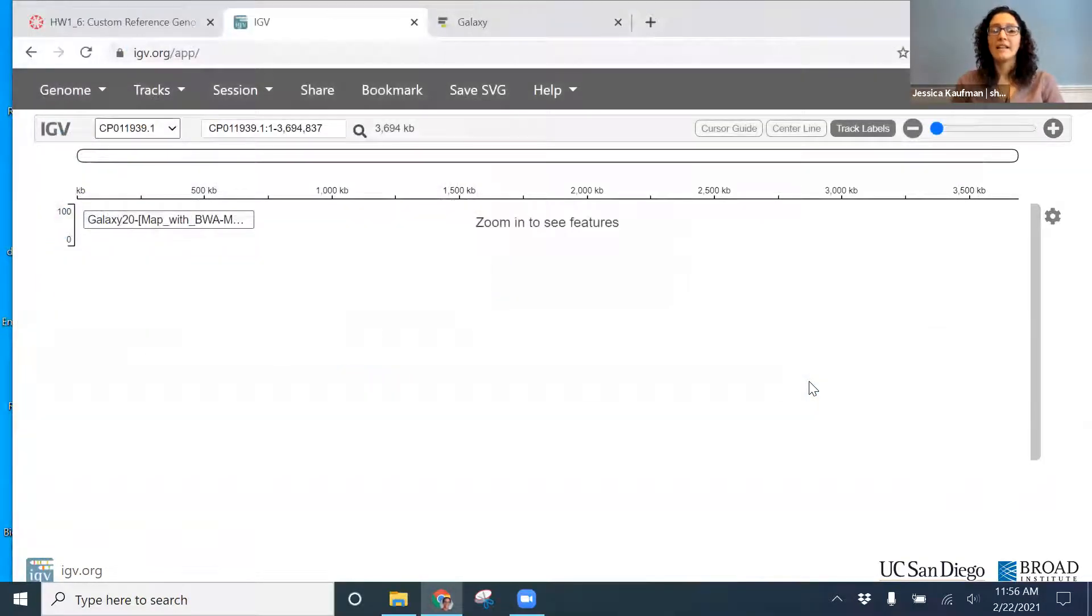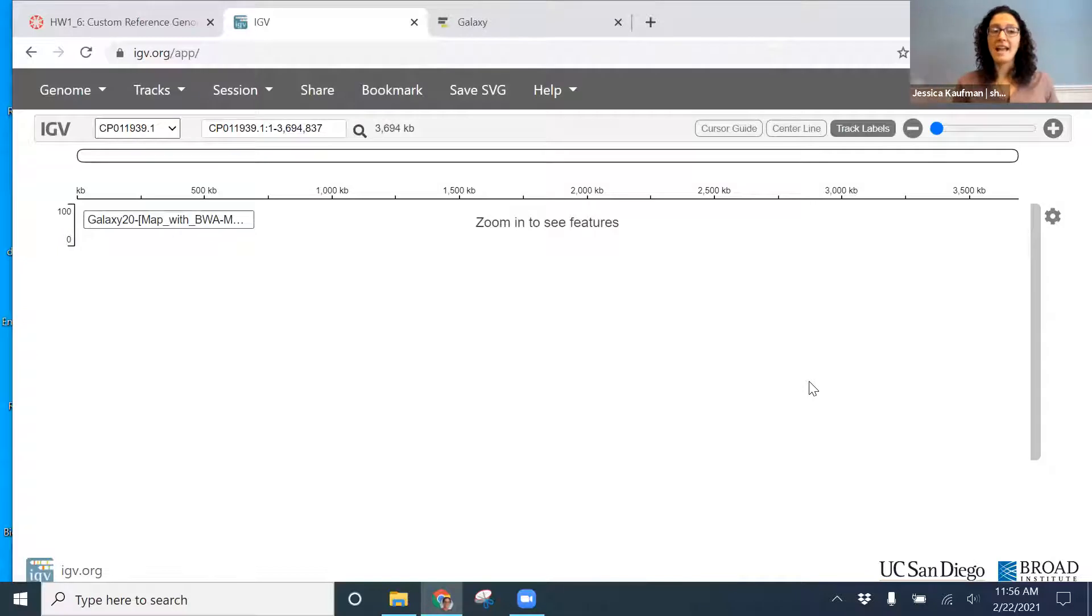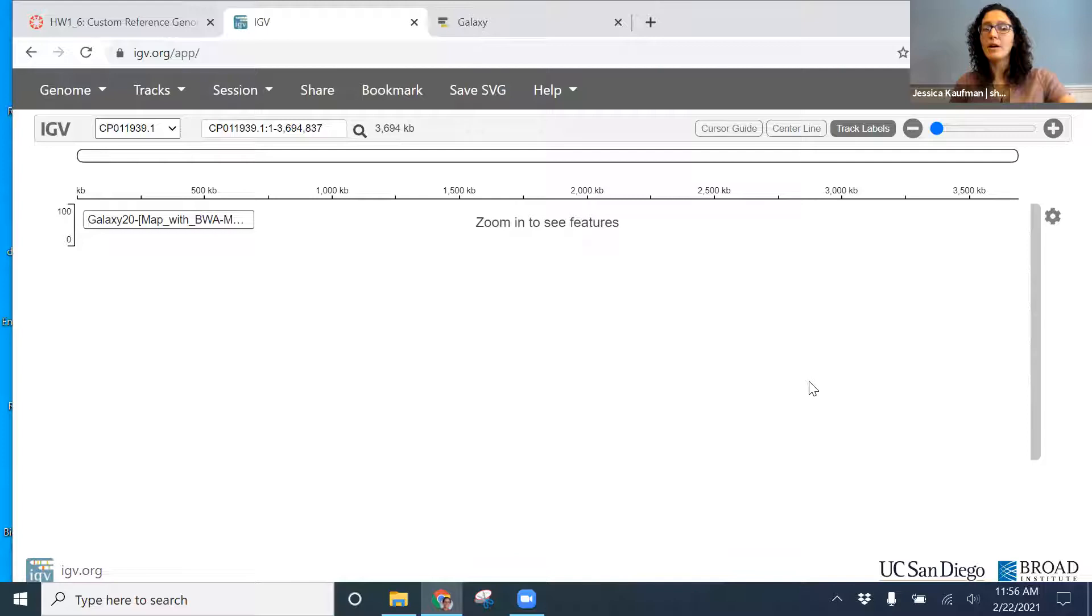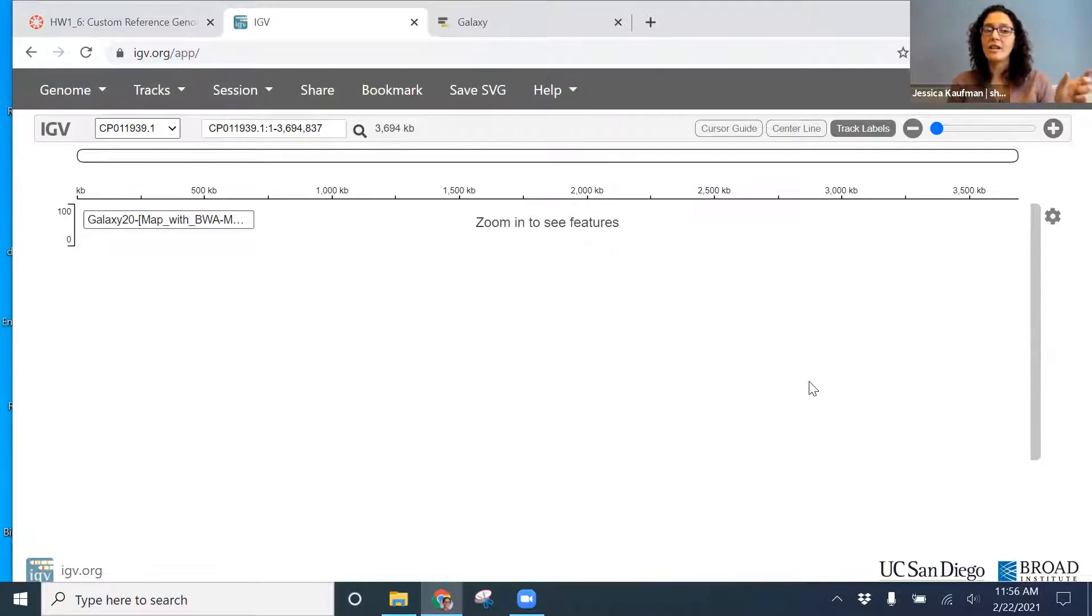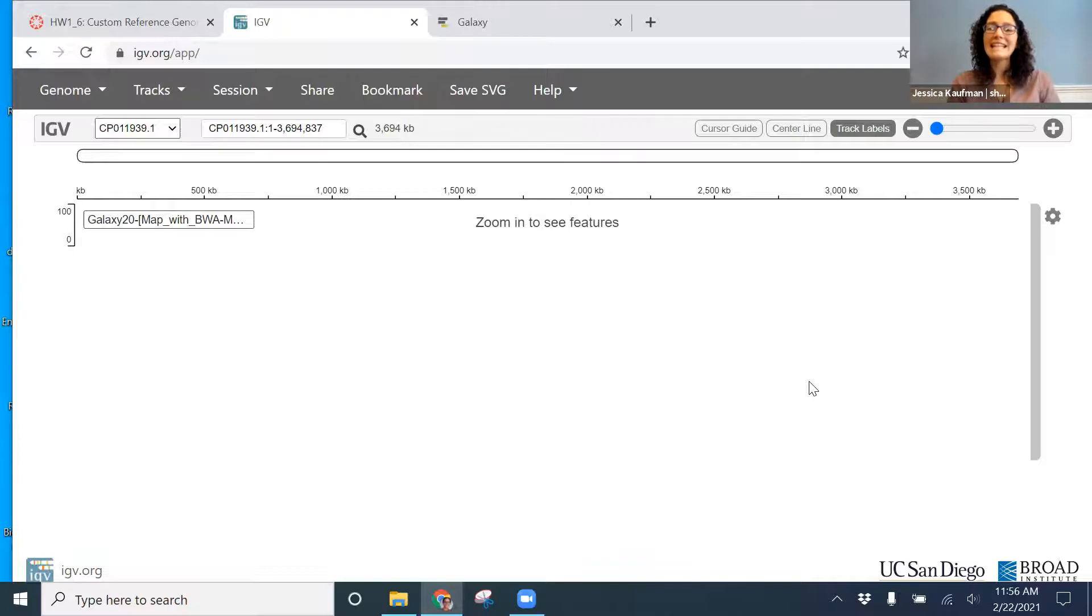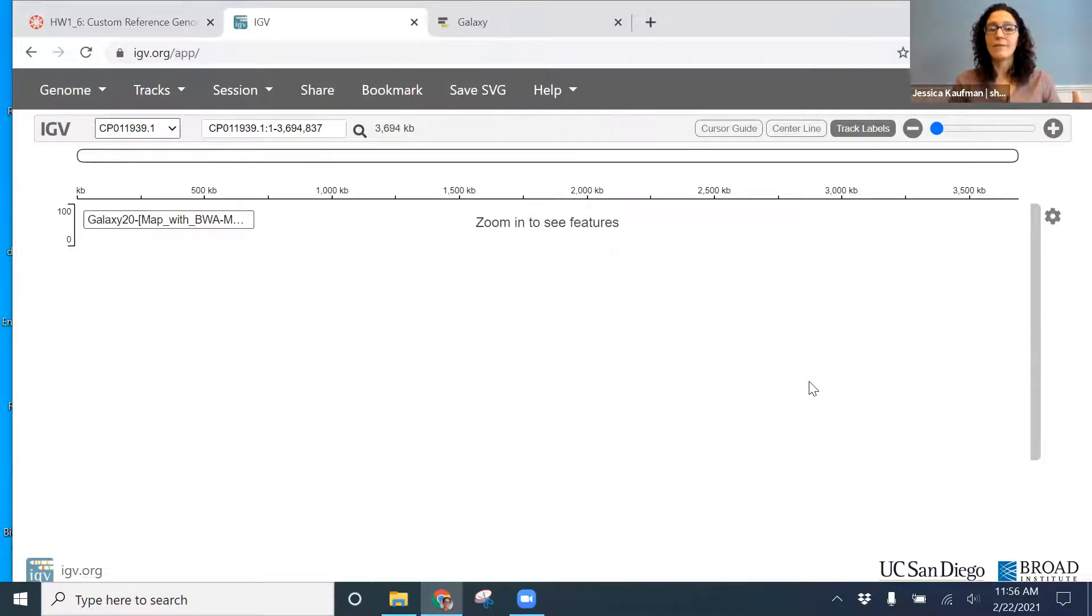I click open, and I can tell something loaded because I see a 0 to 100 bar on the left-hand side, and I see a description, galaxy 20. But I can't see any of my data because I'm too zoomed out.